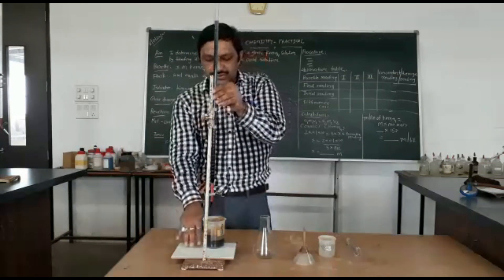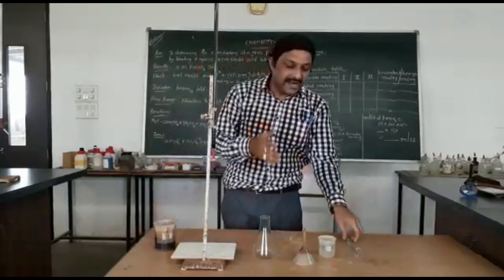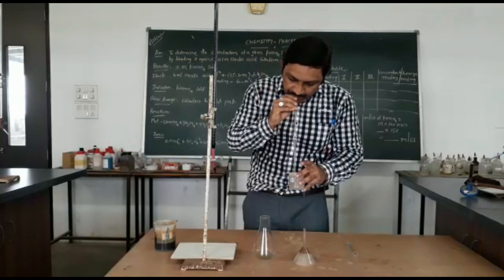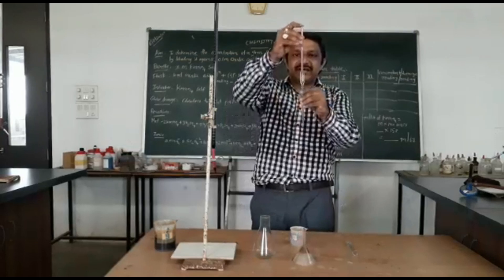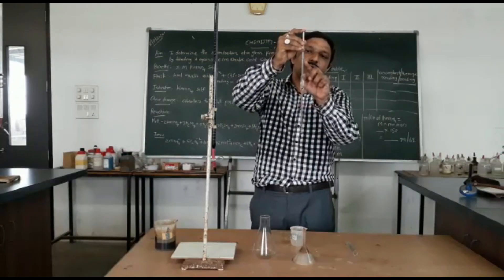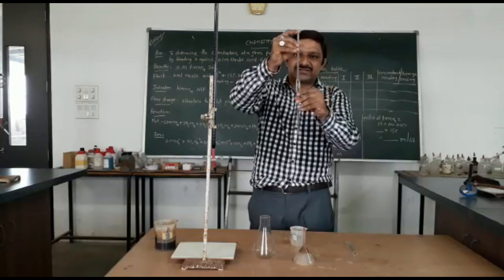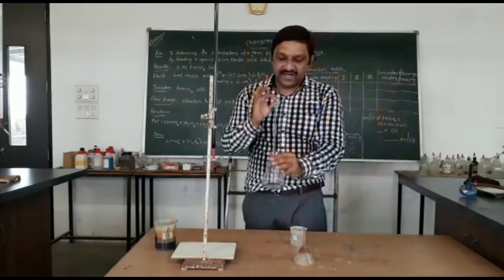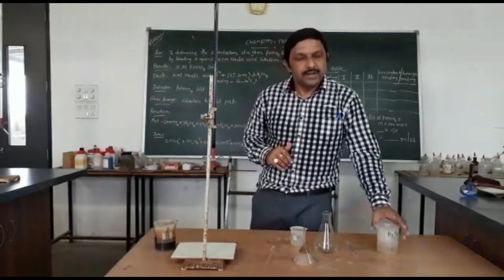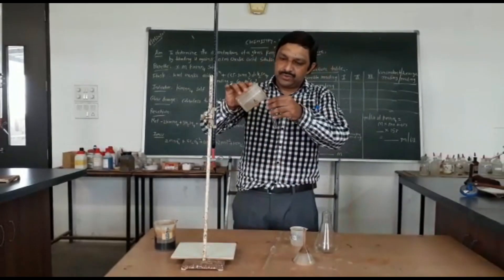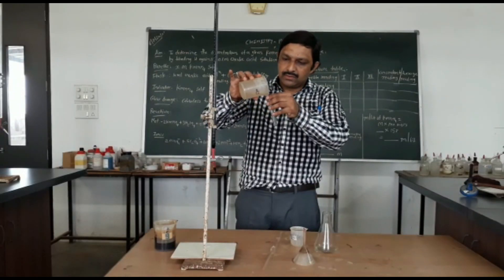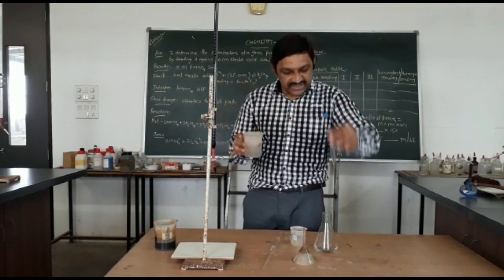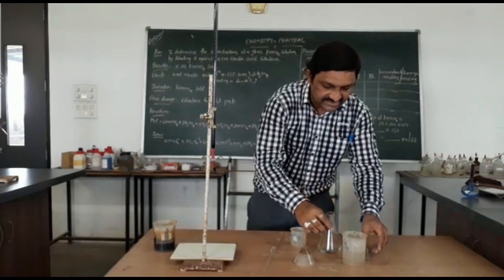Now add 10 ml of oxalic acid solution into your conical flask using a pipette. Take the lower meniscus reading since oxalic acid is a colorless solution. Then add one and a half test tubes of dilute sulphuric acid into your conical flask.